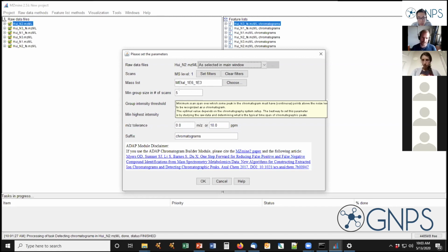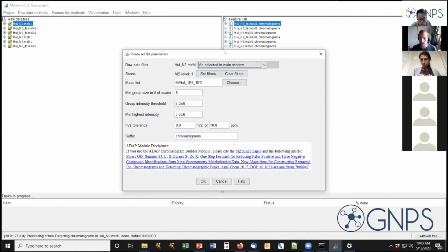That setting helps remove such noise by putting this restriction that masses need to be present 5 times after each other. And how to set this?